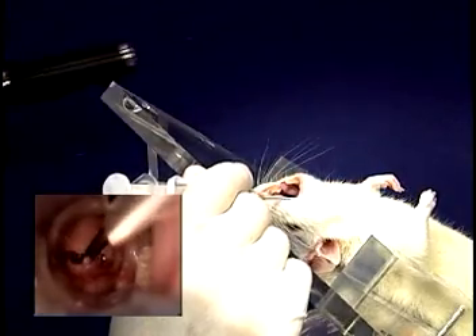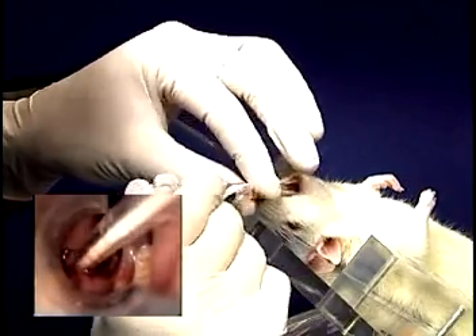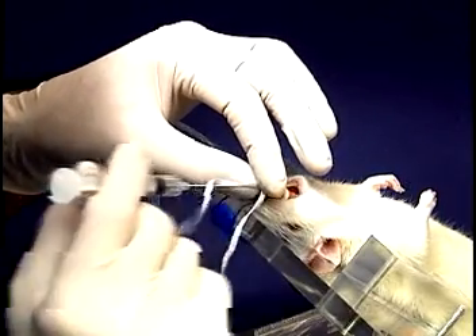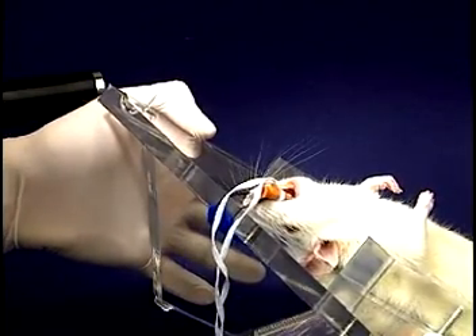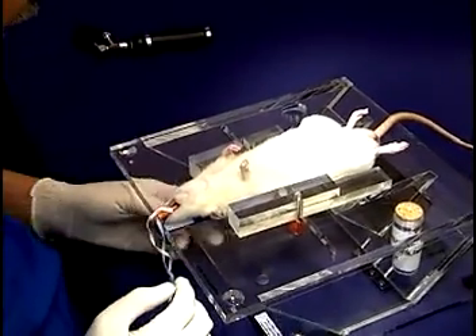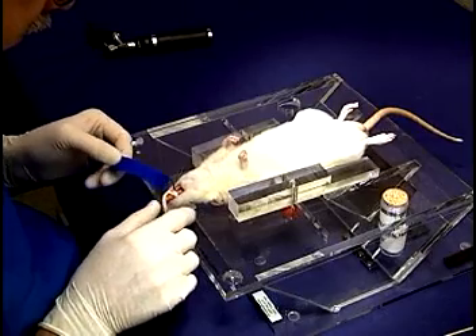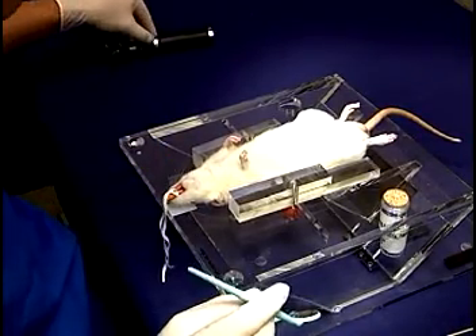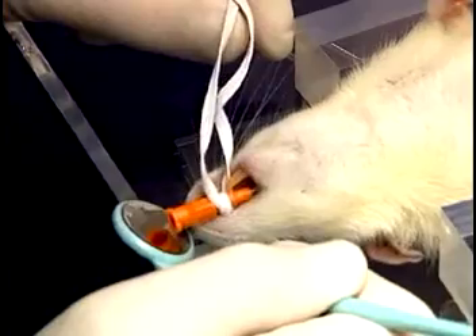The guide wire is then inserted through the cords. The speculum is withdrawn and the tube is gently advanced through the cords and into the trachea. The tube should be advanced until the ties are behind the upper incisors. At this point, the stand can be lowered, the tooth loop removed, and the dental mirror provided in the pack can be used to confirm successful intubation.